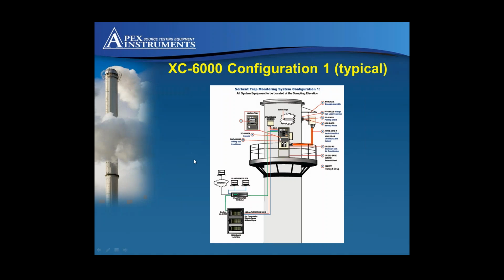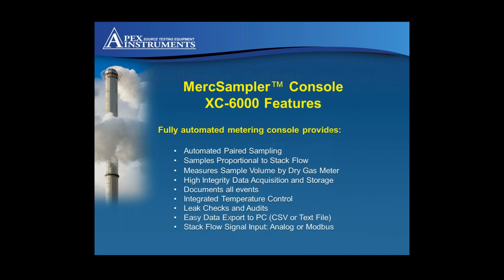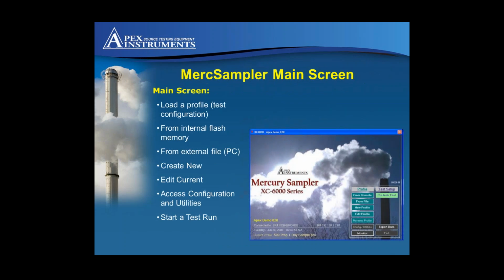Just going back to confirm, guys, you would most likely be looking at this configuration one where you have everything up at the stack location and bringing that communication cable down to a SEM shelter or wherever you have your DAS. Is that correct? That's correct. Okay, perfect. All right. Great. Well, maybe we'll have Dave walk you through a little bit more of the software and show you some of the features and what we have available. Okay, good.